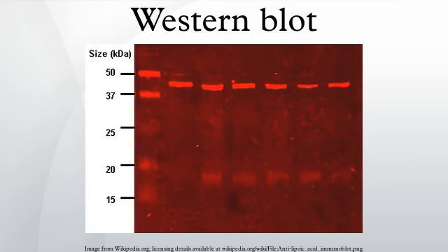The isoelectric point of a given protein is determined by the relative number of positively and negatively charged amino acids, with negatively charged amino acids contributing to a low isoelectric point and positively charged amino acids contributing to a high isoelectric point. Samples could also be separated first under non-reducing conditions using SDS-PAGE and under reducing conditions in the second dimension, which breaks apart disulfide bonds that hold subunits together. SDS-PAGE might also be coupled with urea-PAGE for a 2-dimensional gel.